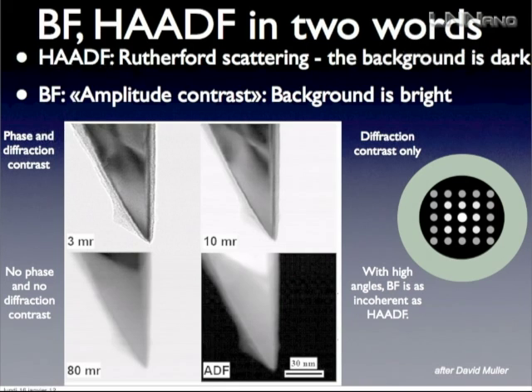And hopefully, because you send electrons onto a thin sample, you think that every electron has been scattered, but in the direction of the electron beam path. So it has to be detected somewhere. In this bright field, with a very high angle, you have some of the electrons, and the rest of the electrons have hit the HAADF detector. So it's the sum of both. If you sum both of them, you have a constant contrast. Okay, so they have to be complementary.